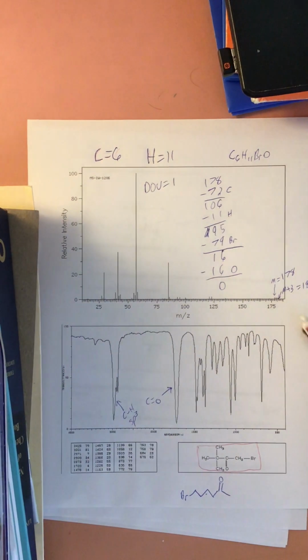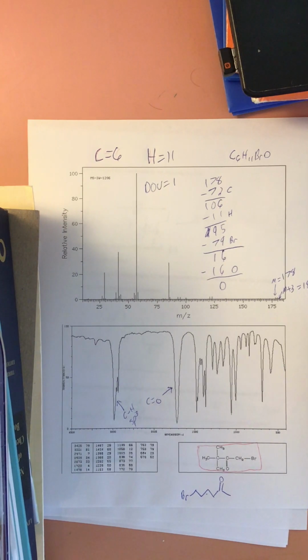Okay, since the last time I tried this, apparently things cut off and was not so good. So I'm just going to quickly re-explain this one, and I'm not going to show the other one. You have the M plus 3 peak over here at 181. The M is going to be 178. This is your molecular form or molecular weight, not formula.